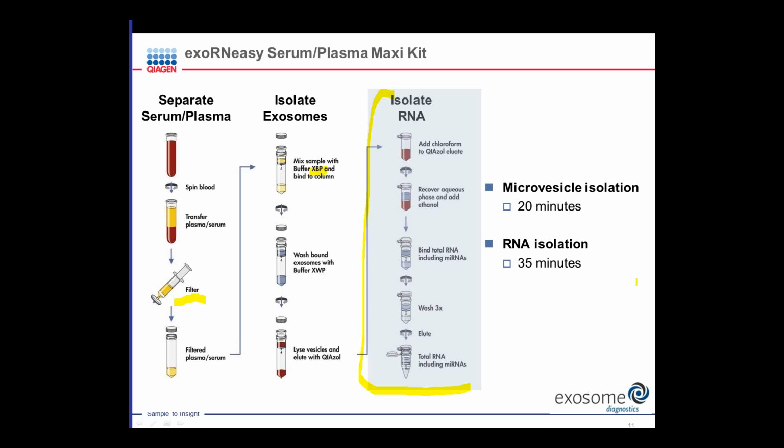For microRNAs, the story is a little bit different. There's actually quite a bit of microRNAs both outside of exosomes and inside of exosomes. Their makeup is a little bit different. Stuff that's in exosomes typically is shed by cells and shed in great numbers by cancer cells. Material that's outside of the exosomes is often released during apoptosis. It could be released in a disease such as liver disease or kidney disease, or in tumors where there's a lot of apoptosis going on. So the choice of doing total RNA and looking at the microRNA component or doing an exosome purification generally would depend upon what microRNAs you're interested in, where they're mostly located, and whether one of the other procedures optimizes the signal-to-noise for your experiment.